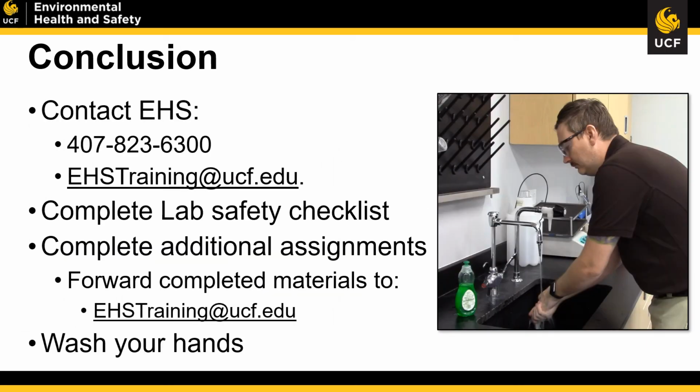Congratulations, you've made it through the EHS 202 online safety training course. At this point, we've covered all the material listed on the orientation safety training check sheet. Please check all these boxes, sign and date it. If you have further questions about any of these concepts or materials, please reach out to the Environmental Health and Safety Department and we'll be glad to assist you with that process and answering those questions.